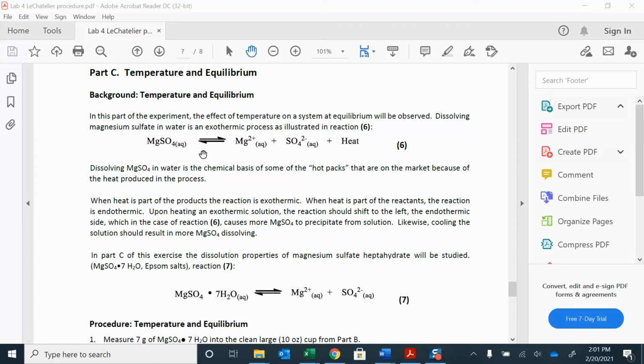So what you would see there again is, do I form the solid? I'm going to reach equilibrium. I'm going to completely saturate this solution, and I know I'm at equilibrium when I see some solid present, right? I have completely dissolved as much as I possibly can, and then there's still a little bit of solid left. That's going to be my saturated solution.